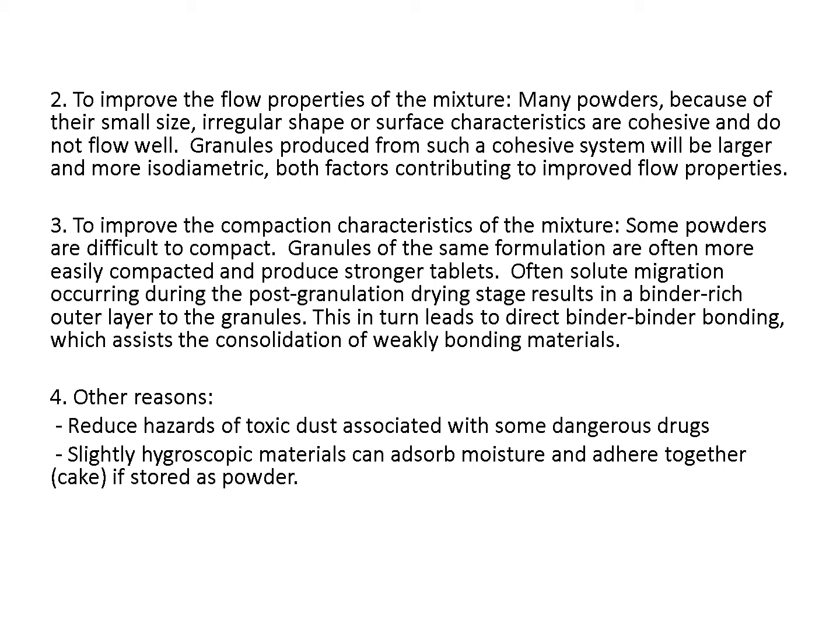Also, if we have hygroscopic powder materials, if they are fine, the surface area will be high, and a higher amount of water will be absorbed at their surface, and they will form a hard cake.